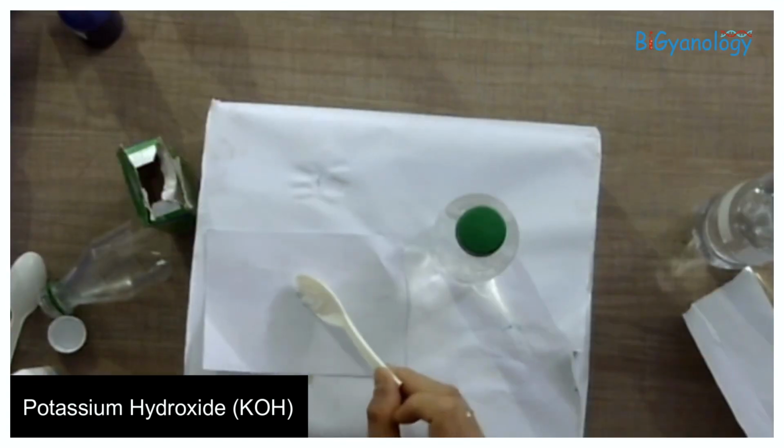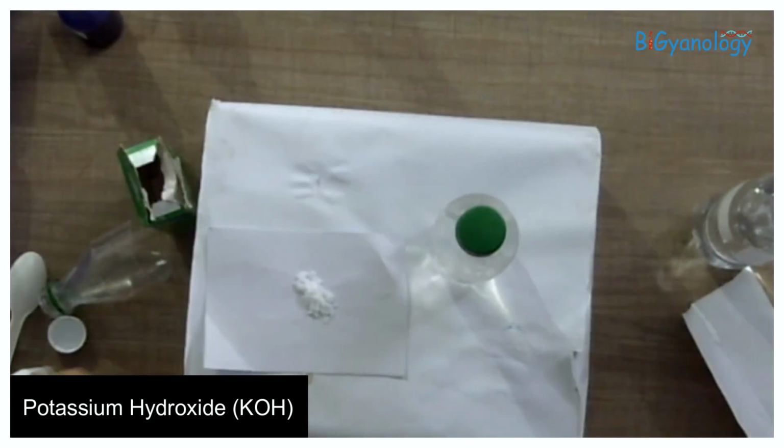So this is a glucose solution. Here we are giving some potassium hydroxide, using a makeshift funnel.